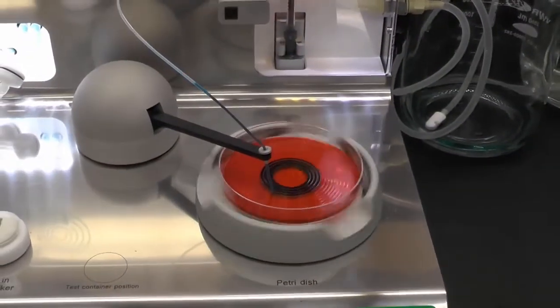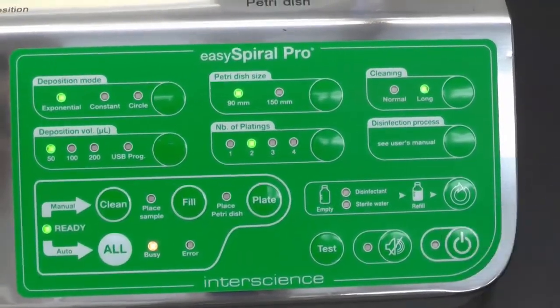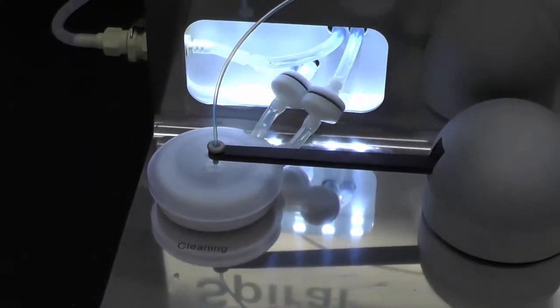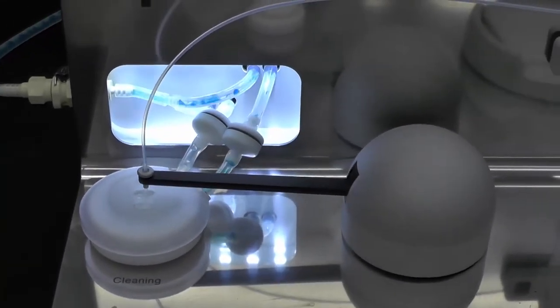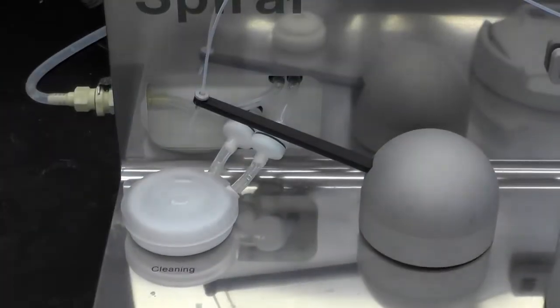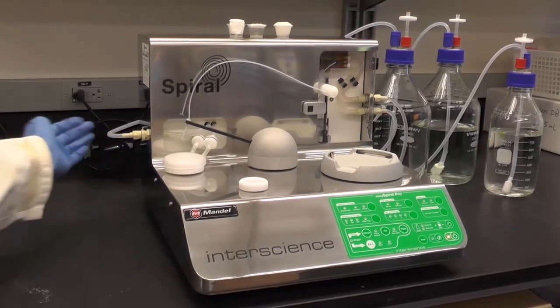After you finish, press the power button on the control panel and the instrument will automatically clean itself before shutting down. Wait until the light is off, then turn the power switch at the back to the off position.